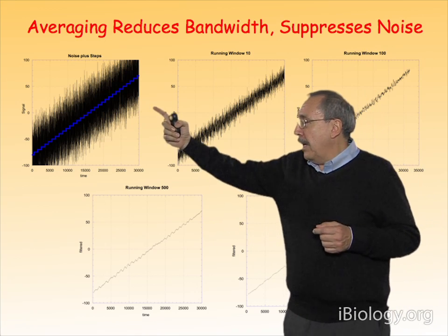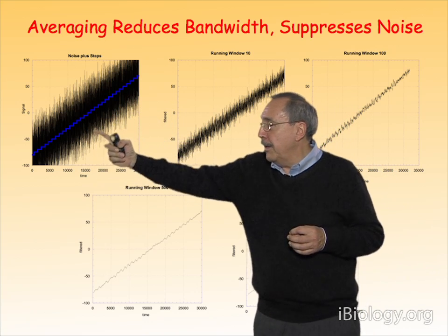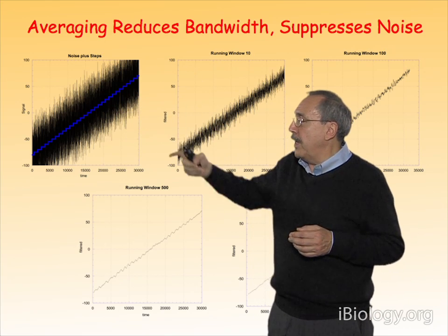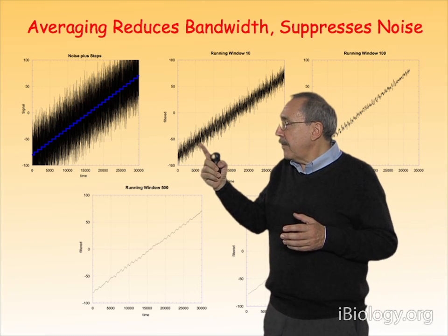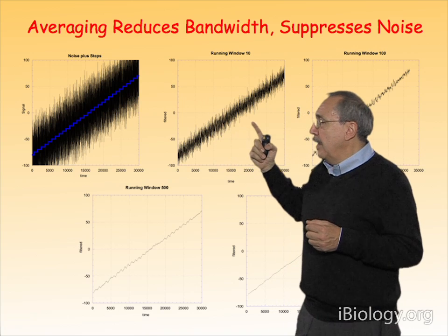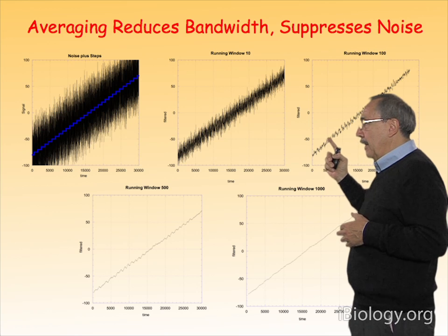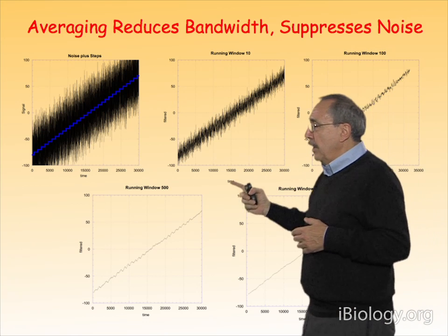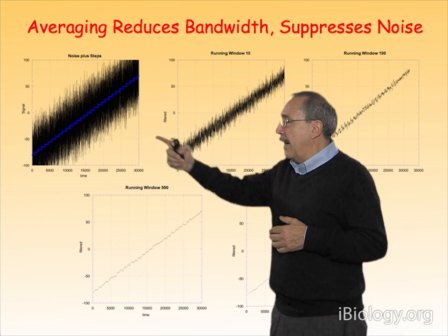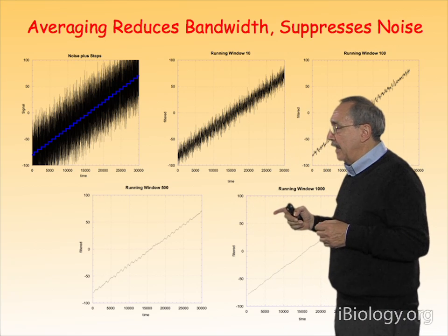So of course, if you have some kind of signal, as indicated here by this staircase feature, that is superimposed with the noise of your trap, as you reduce the bandwidth, you will average out quite a bit of that noise, and eventually you may be able to begin to see the individual signal that you want. But of course, if you overdo it, maybe here you can still see the individual steps that are underneath, corresponding to the dynamics of the motor, for example, if you imagine that that's what you are observing.